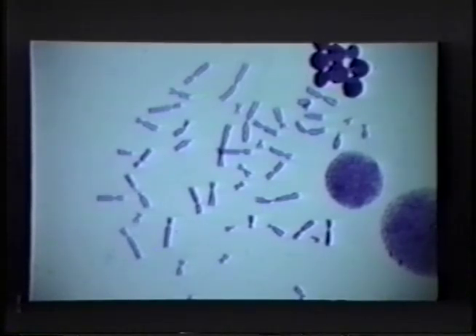And it turns out that this technology is important in a variety of applications these days. Depending on the probes that you choose, it allows you to investigate the nucleic acid organization of the interphase nucleus. In terms of the Human Genome Project, it allows you to localize cloned DNA sequences along a particular chromosome. And I think probably most importantly, it allows you to begin to have a look on a cell-by-cell basis at the genetic aberrations that are associated with genetic diseases.